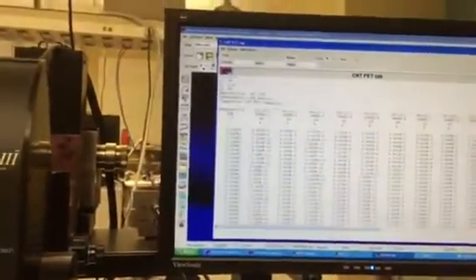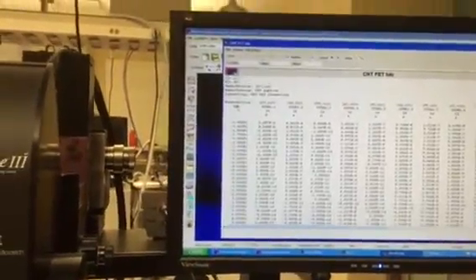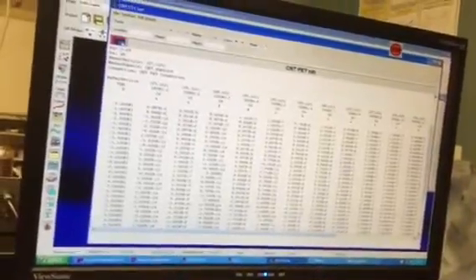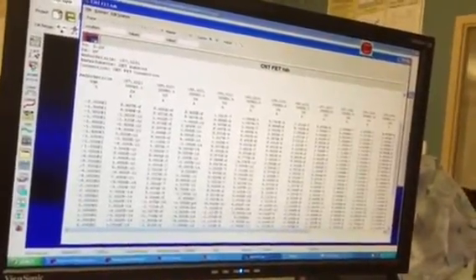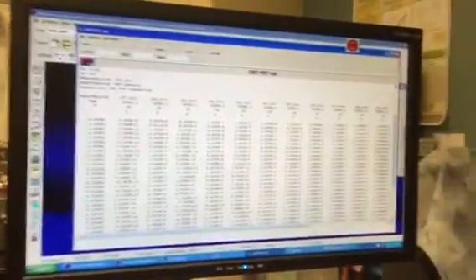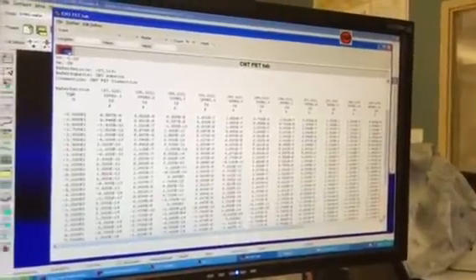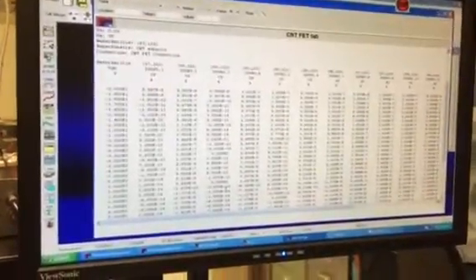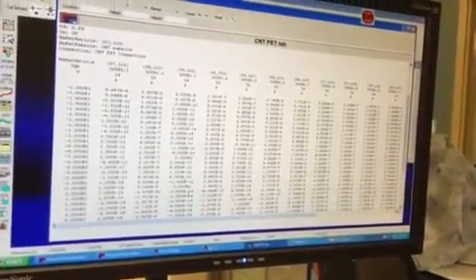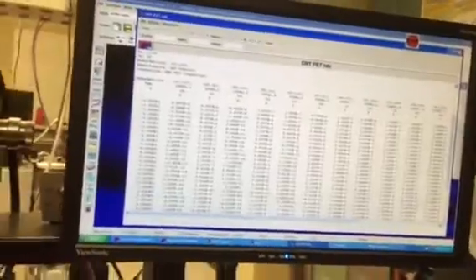So now you've got them all going that way, and that can be exported as a CSV or text file as well. Instead of showing the plot and then going up to file export, you can go into the script and under layout say layout and have it exported automatically. Let's say you weren't around and you needed this data, you could call up and say, hey, can you run the IDVBG wafer full report script, and someone could put the wafer on, run it, and all your reports would come out even if they didn't know what to do. That's the benefit of it.